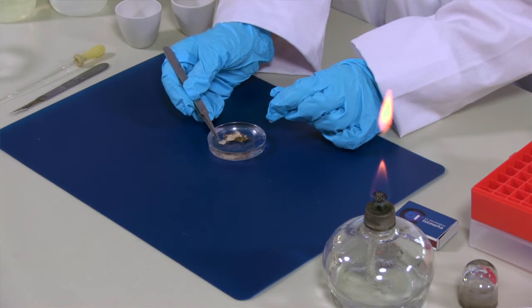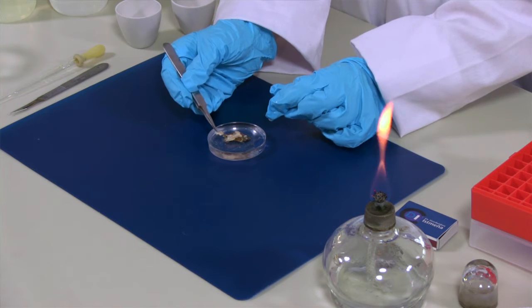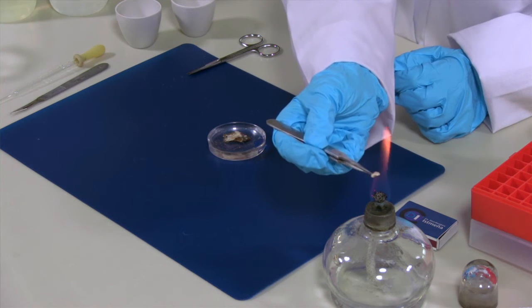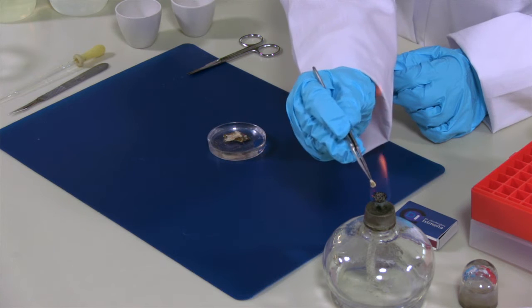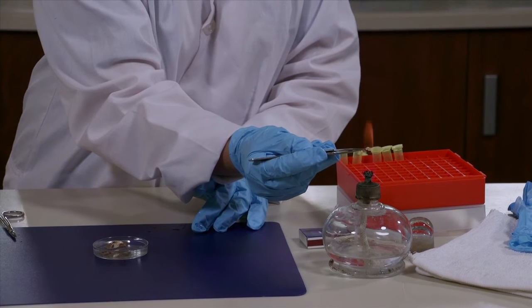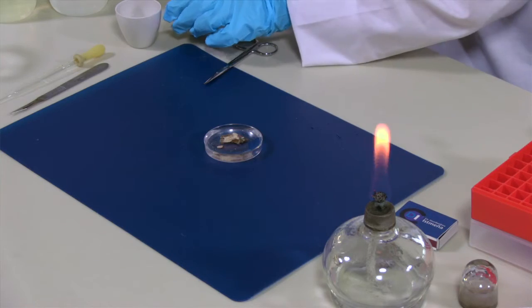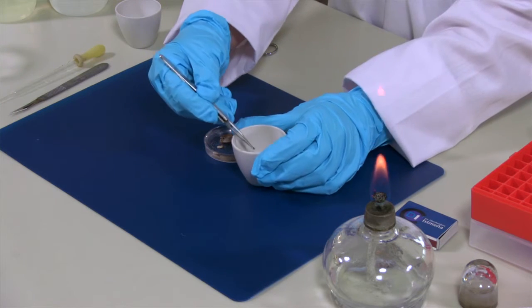Now I'm going to take this piece and burn it in an ethanol lamp. You have to burn it until it gets dark. So now that it's burned, I'm going to put it inside this crucible.